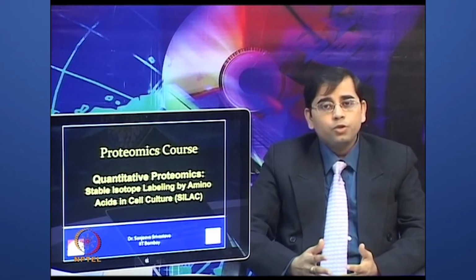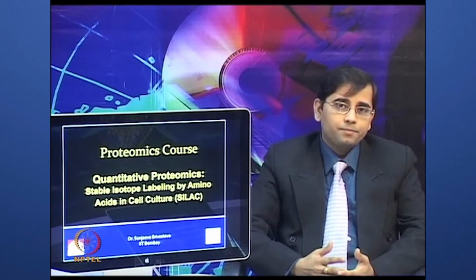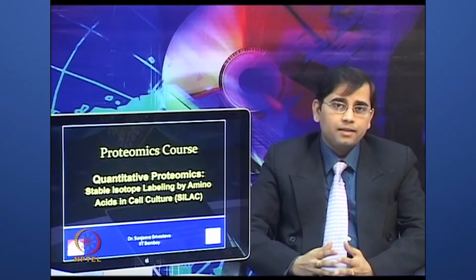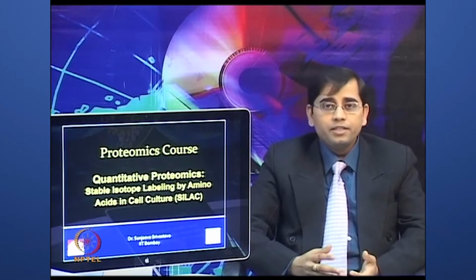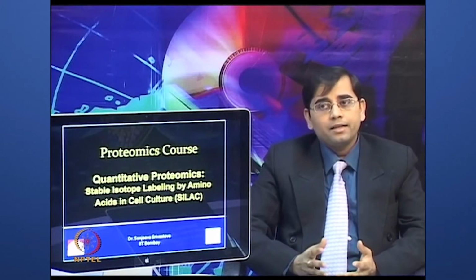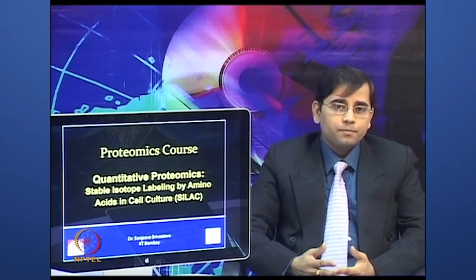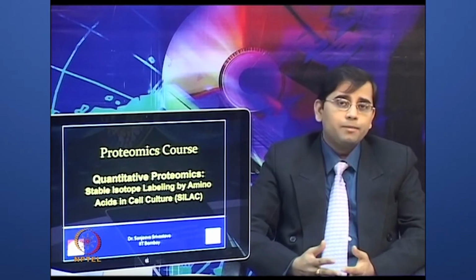MS has proven to be an extremely powerful tool to characterize protein complexes. However, MS is not a quantitative technique to begin with, and peptide ionization efficiency is unpredictable. So, the usefulness of this data for quantitative purposes remains limited. Many advancements in MS during the last decade have provided new ways for protein analysis and facilitated the proteomic analysis of various biological systems.